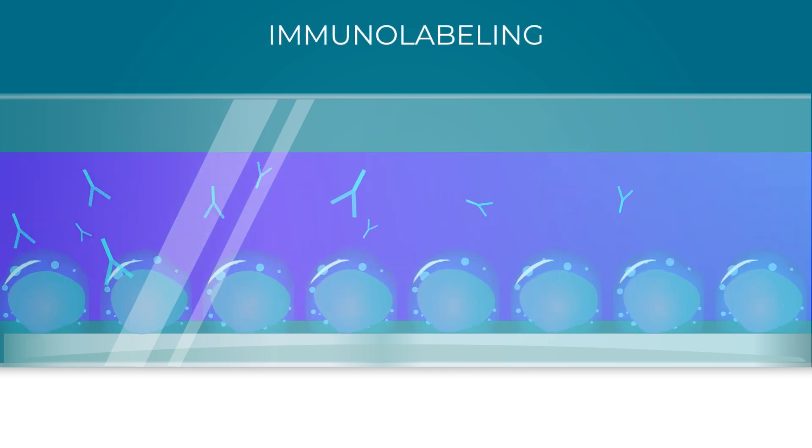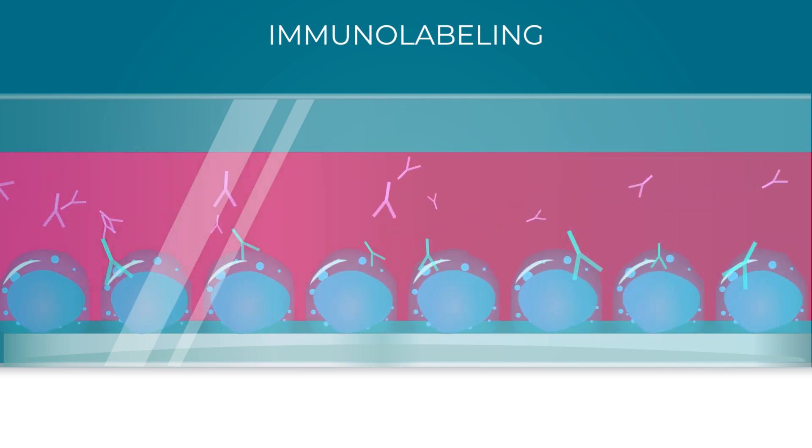ARIA automates protocols such as immunostaining by programming the time delivery of primary and secondary antibodies, the injection volume and flow rate, as well as the incubation time.